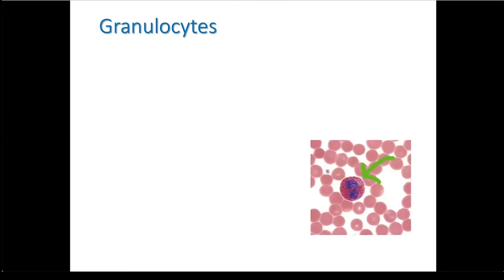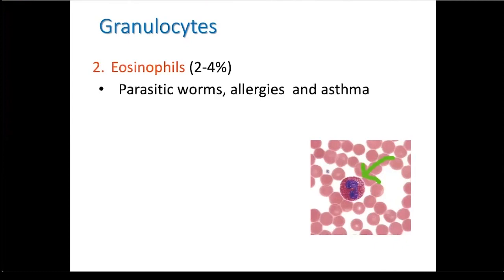A second type of granulocyte are the eosinophils that make up between two to four percent of the leukocytes. Their numbers are elevated during parasitic worm infections, allergies, and asthma. Their nucleus contains two lobes and the granules stain red.